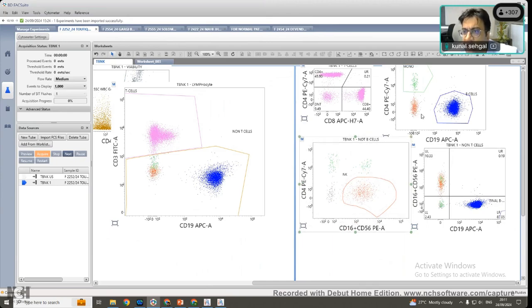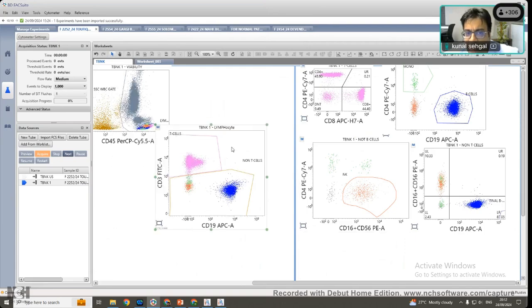So these green cells are not CD8 cells. They are CD4 positive but not CD3 positive. They are negative for 19. They are practically negative for 1656. Some amount of 16 they are showing. So now you will say, why in lymphocytes are non-T cells expressing CD4?